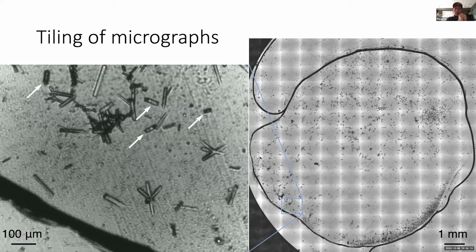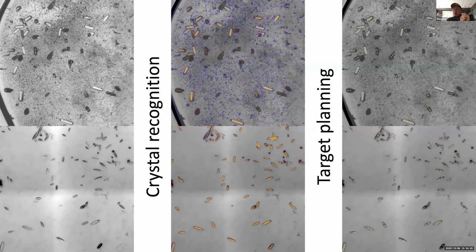So then what? After we get this, we developed some computer recognition algorithm, so that these are the raw images. Both of them are the raw images. And then we can recognize those line segments in different colors, meaning a different stage of the auto recognition. So I'm not going into too much detail of how this is done. This becomes an entirely different topic.